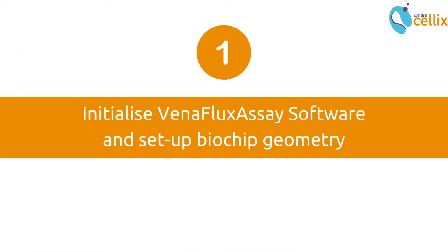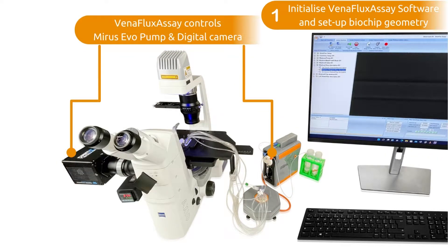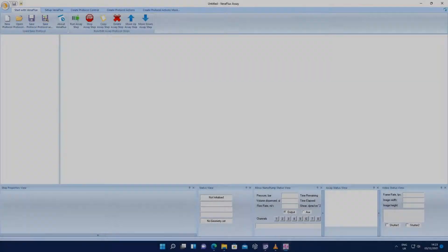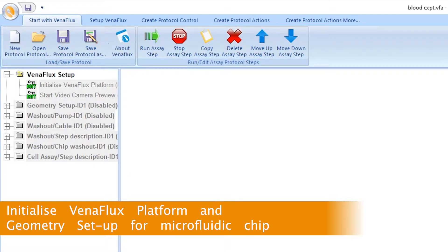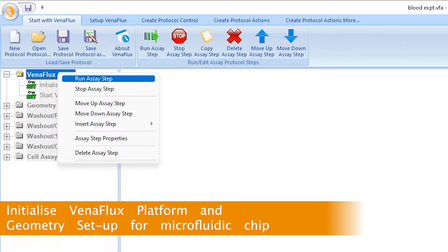Initializing Venaflux assay software enables control of the MyReceivo pump, and in the case of the Venaflux Pro platform, it also enables control of the digital camera connected to the microscope. Open the Venaflux assay software program and open the default protocol. This loads a default program which may be edited according to the user's needs.